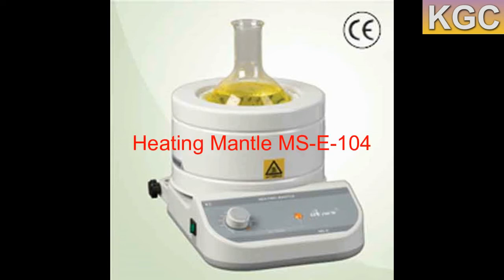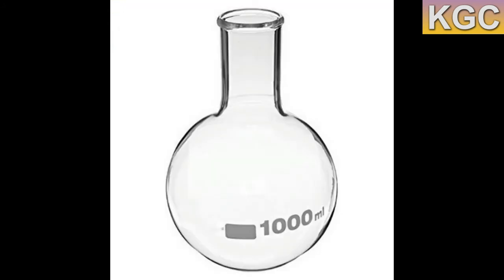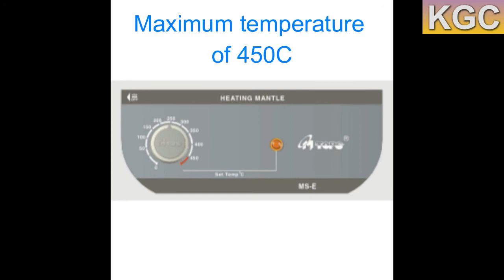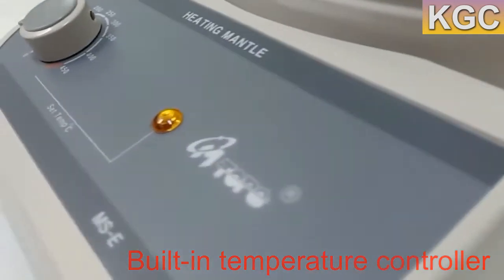The heating mantle with regulator control MSC 104 is produced by Korean brand New Tops. It is used for round bottom flasks, reaching a maximum temperature of 450 degrees Celsius. The heating mantle has an analog built-in temperature controller and can be controlled effectively from low temperature to high temperature.